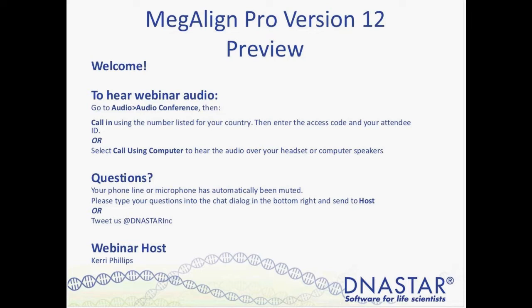In this webinar, Jackie will provide a sneak peek of the new features coming to MegAlign Pro in Lasergene 12.